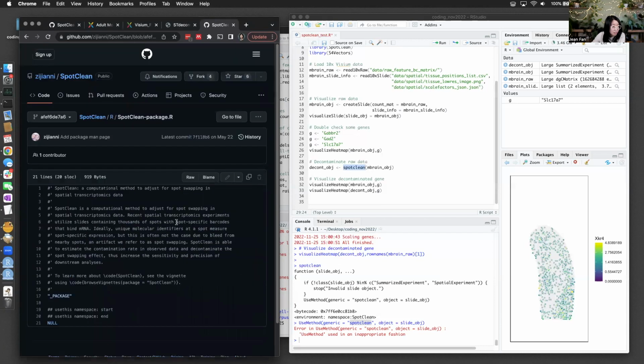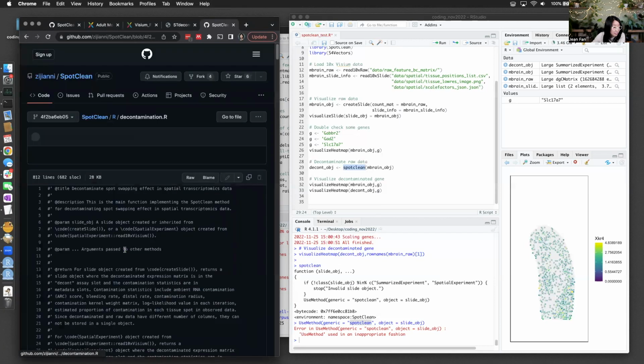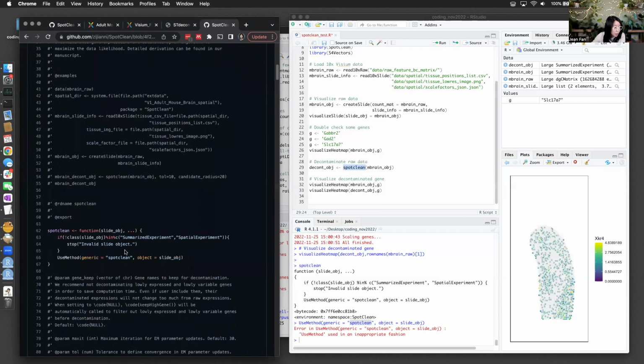Package. Oh my God. Yeah, send it somewhere here. Yeah, okay.